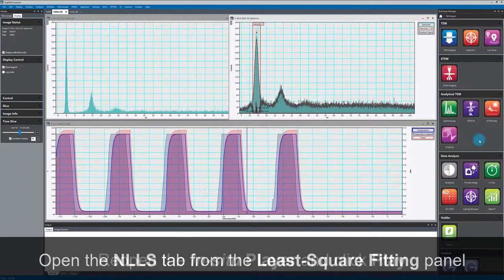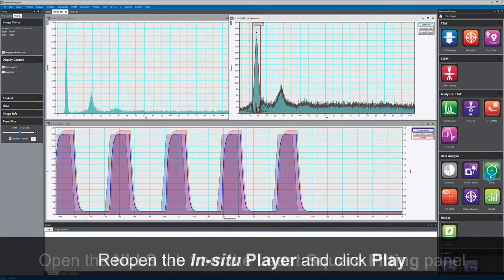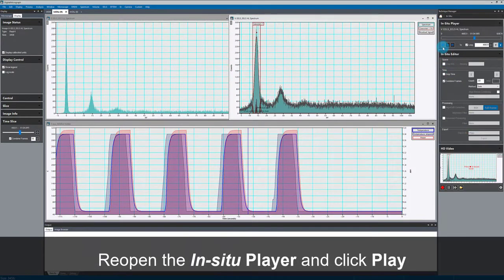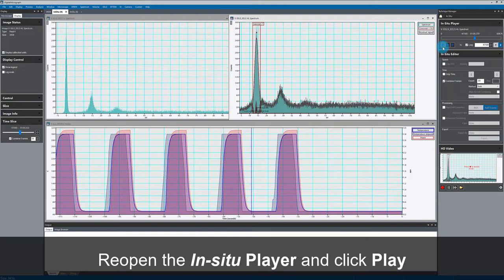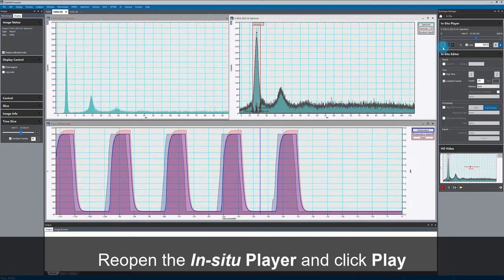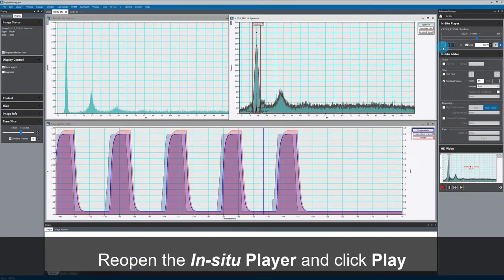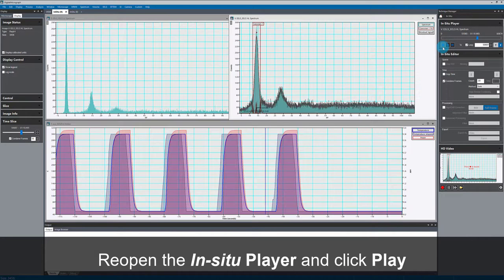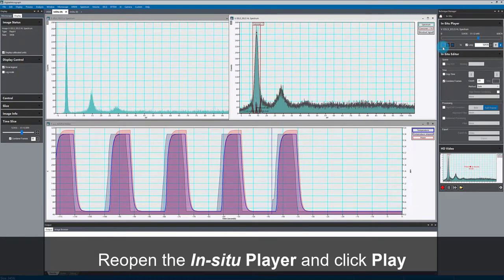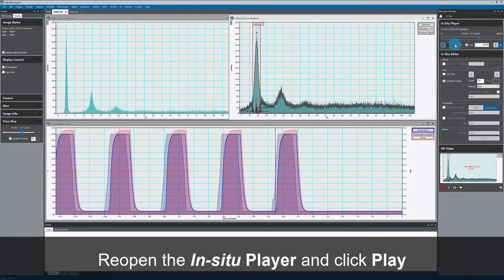If I go back to my in-situ player and play back the data, then this fit is updated live. So as the temperature ramps up and down, I'll see the shift in the plasmon peak position.